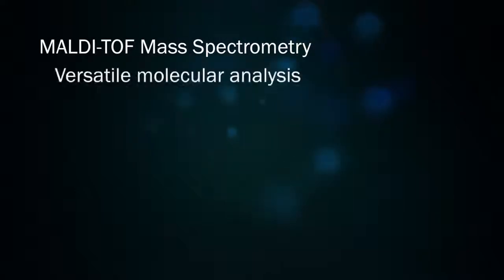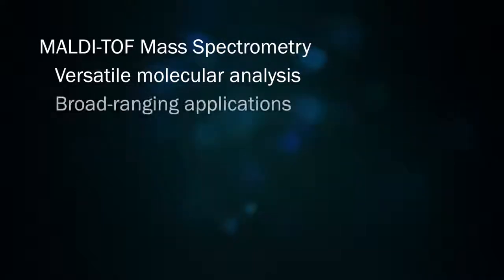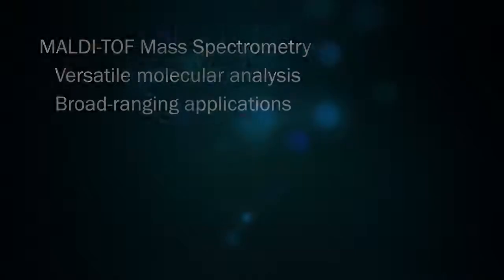MALDI offers versatile molecular analysis with broad-ranging applications. There's really no limit to who might use MALDI. So there's the traditional path of a chemist or a biochemist looking to study some compounds using MALDI. There are molecular biologists using MALDI to study DNA, or maybe RNA, or maybe RNA protein conjugates.